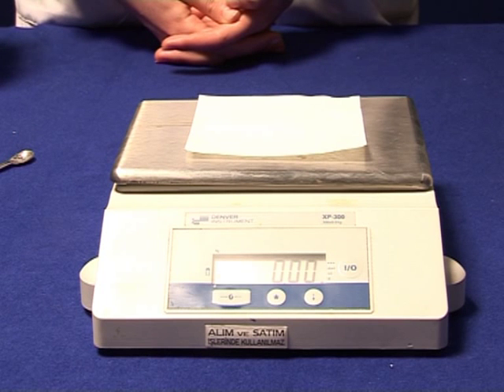The solution: The final volume of solution after adding the acid solution to the ammonia solution will depend on which acid was used.